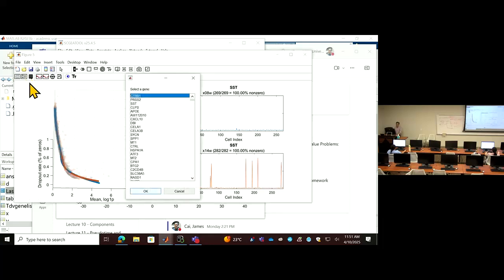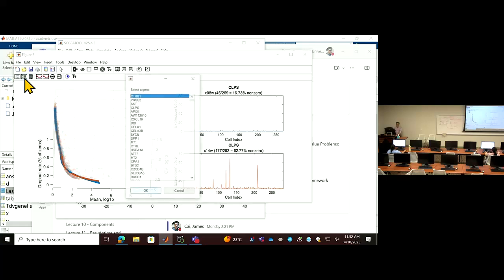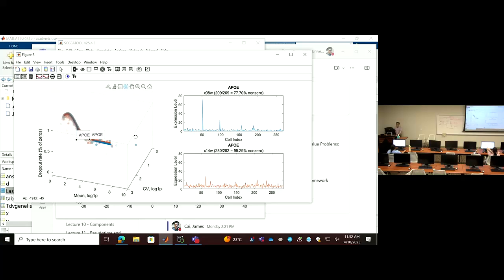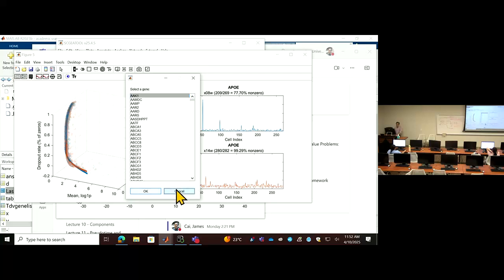And then we can visit the next one. Yeah, so this also changed. This becomes lower because you have more variability in the early stage, while in the later stage, this gene becomes a normal gene without any variability. So you have those lists, top lists of genes.